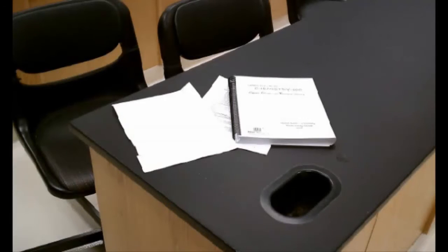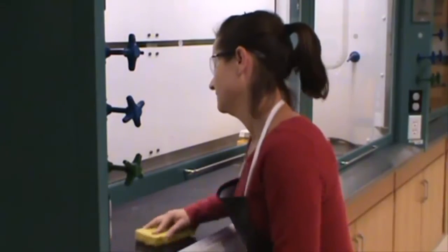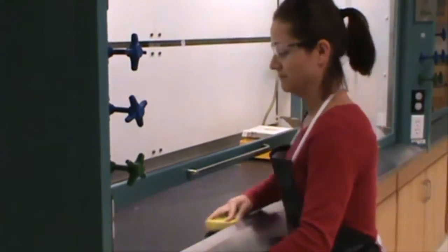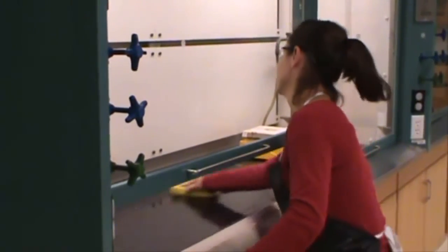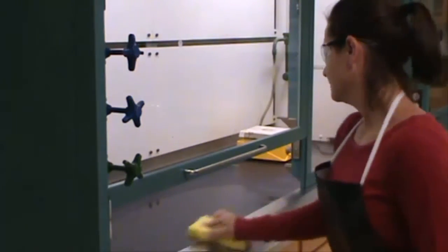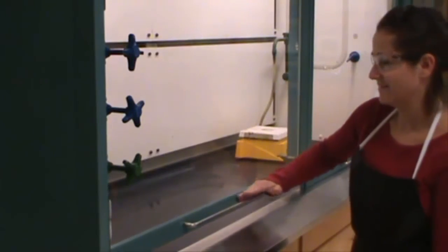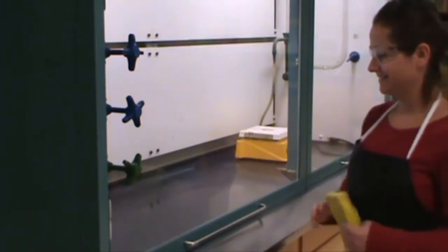Your instructor may turn on the fume hoods at some point, so try to keep your books and any loose papers out of the fume hoods. At the end of the day, use a sponge to thoroughly clean your area in the fume hood. Close the glass shield and turn off the lights.